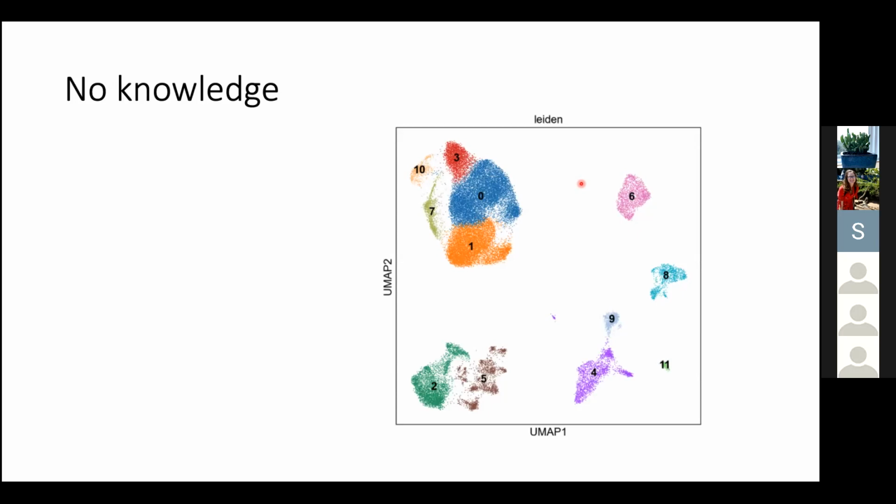What do you do? Okay, here's an idea. You can compare each cluster to see which genes are most differentially expressed in each cluster, which really means which clusters have different gene distributions. In other words, we have to use statistics.